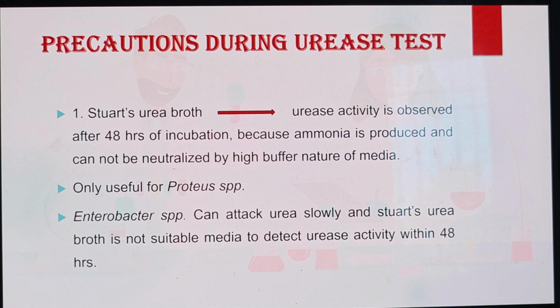Let us discuss some precautions during urease test. If you use Stuart's urea broth, then urease activity is observed after 48 hours of incubation because ammonia is produced and cannot be neutralized by high buffer nature of the media. It is mainly useful for Proteus species. In case of some bacteria like Enterobacter species, it can attack urea slowly and Stuart's urea broth is not suitable media to detect urease activity within 48 hours.